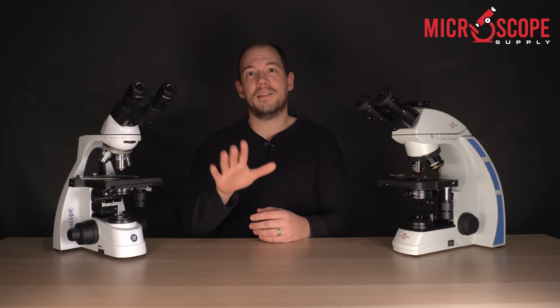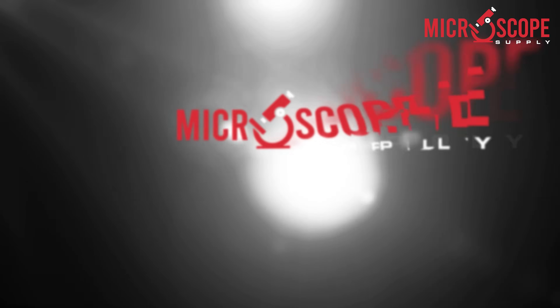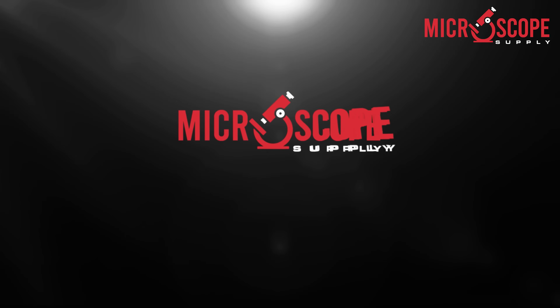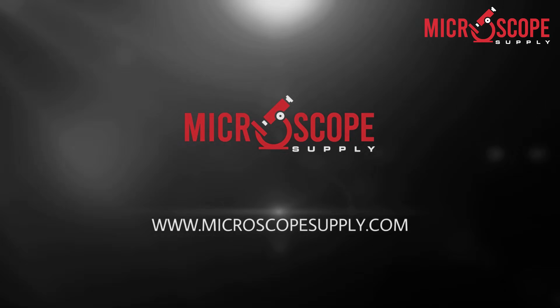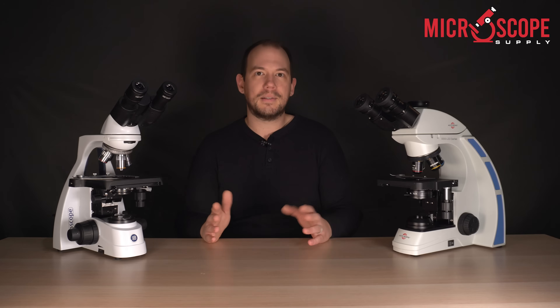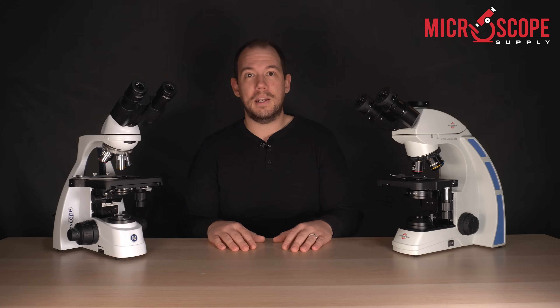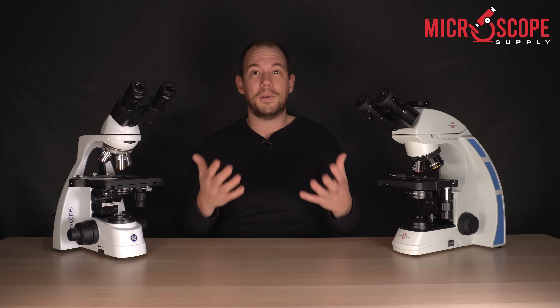Today we take a look at five things that you should look for when purchasing a compound microscope. Trying to answer the question — which microscope is right for me — can be fairly complex, and of course it depends on your specific application and budget. But I do have five things that you should look for when comparing microscopes to figure out which one is going to be the best for your situation.